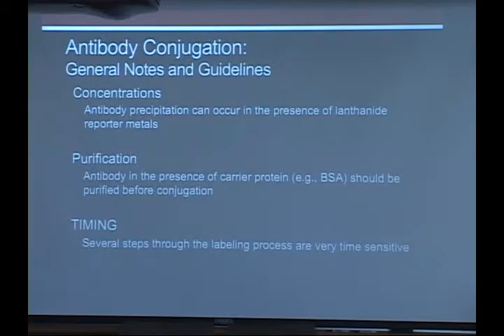The second is, as I mentioned, the purification of the antibody. This is also pretty important, that you don't have any carrier protein in solution with it. Otherwise, all of your polymer will more or less end up bound to that carrier protein and not to your antibody of interest. There are some carriers that don't give us problems, and those are namely ones that don't have disulfide bonds. If they don't have the chemical group that our polymer reacts with, it's fine to keep them in solution. And then the last thing is the timing.